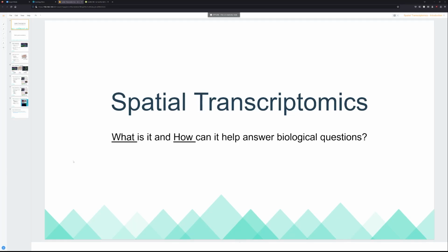Today I think I want to start a tutorial series on how to analyze spatial transcriptomic data. And this video is going to be talking a little bit about what spatial transcriptomic data is, and maybe looking at one of the data sets that I think we could learn a little bit from in analyzing.